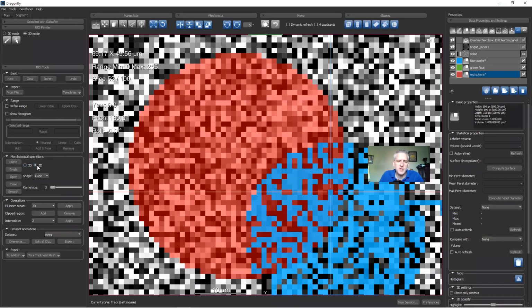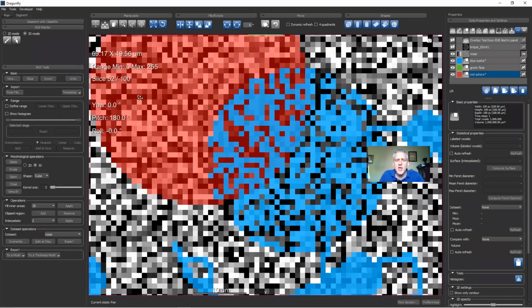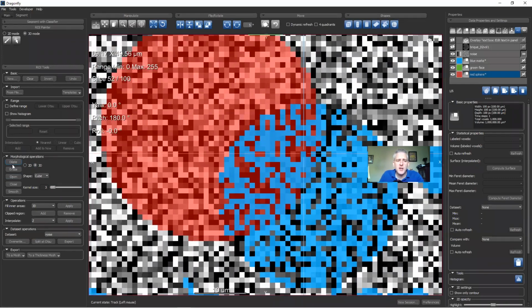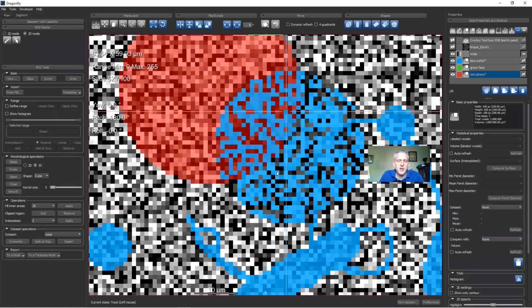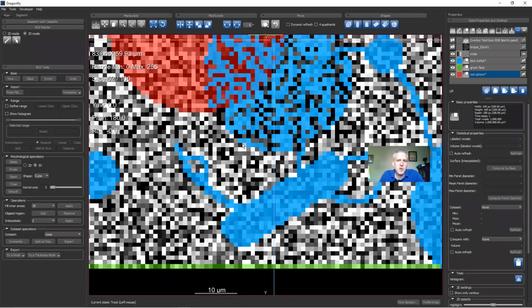We're not going to get into the details of the difference or when you would use each, but let's just say most of the time you want to be operating in 3D. Now, if we do the dilation and erosion and we look at it, if you have a data set that's not complete, you might want to see some of the behavior. So what I mean by not complete, I've got some holes in this blue ROI.